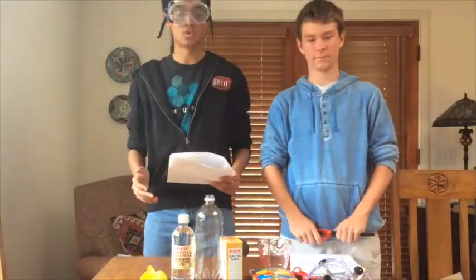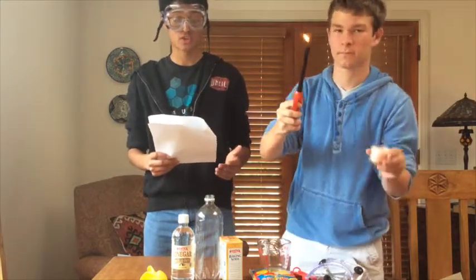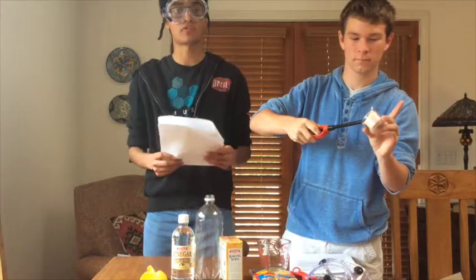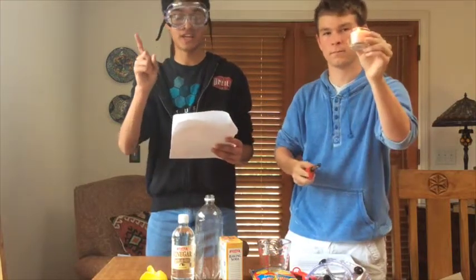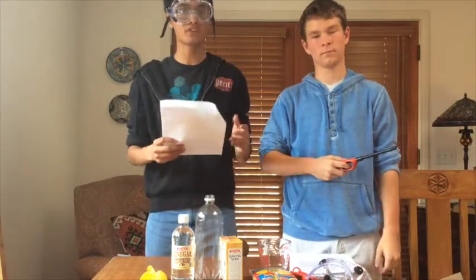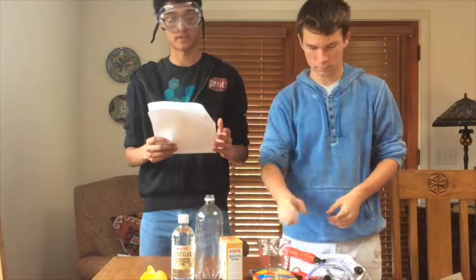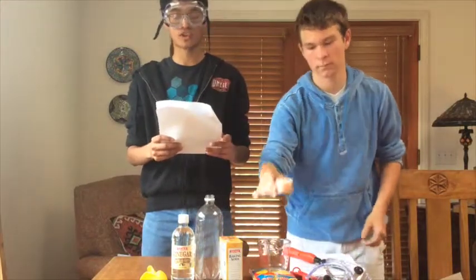Today, we will also be working with open flame. Fire can be very dangerous if not dealt with carefully, so it is important that you listen to these rules about fire safety. First, never leave the room if there is an open flame in use. Always tie back long hair and pull back loose articles of clothing. Know where the fire extinguisher is or another firefighting agent.